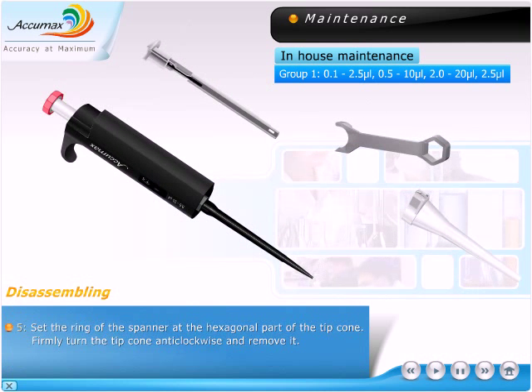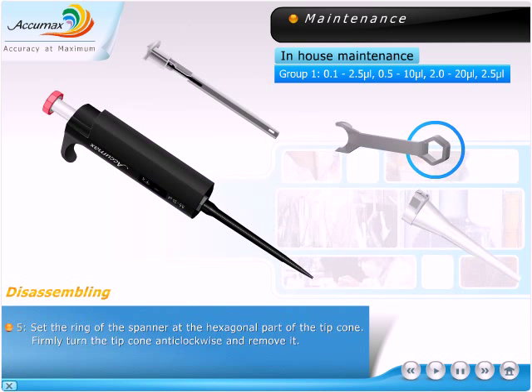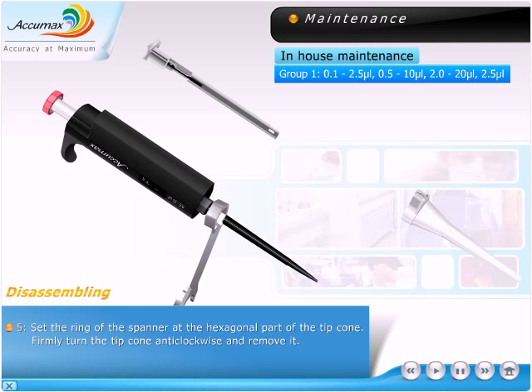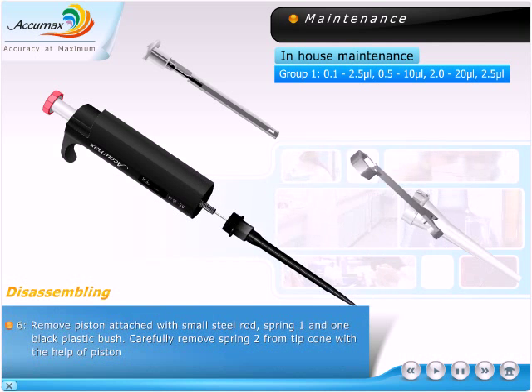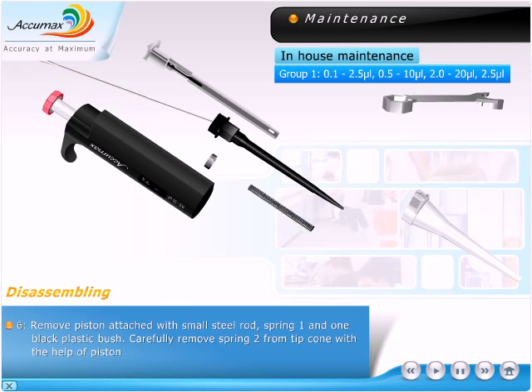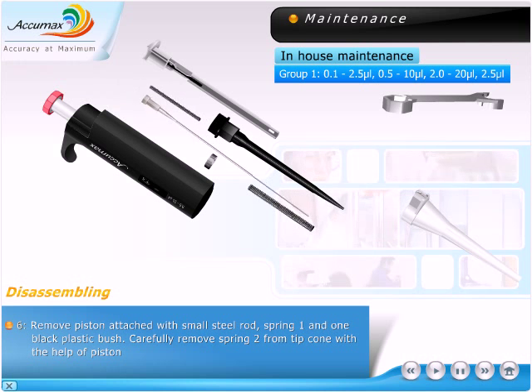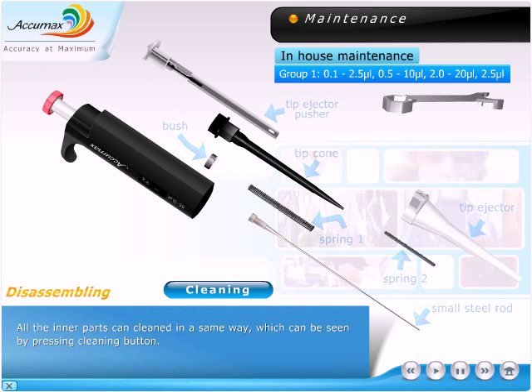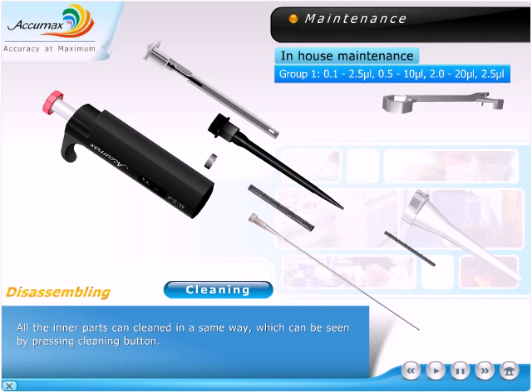Set the ring of the spanner at the hexagonal part of the tip cone. Firmly turn the tip cone anti-clockwise and remove it. Remove the piston attached with a small steel rod, spring 1, and one black plastic bush. Carefully remove spring 2 from the tip cone with the help of the piston. All the inner parts can be cleaned in the same way, which can be seen by pressing the cleaning button.